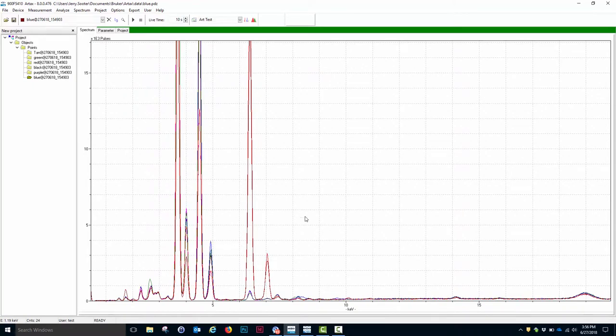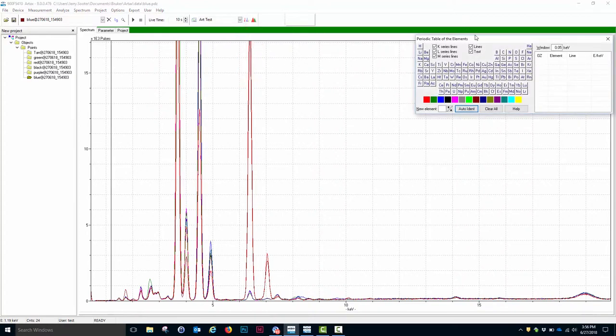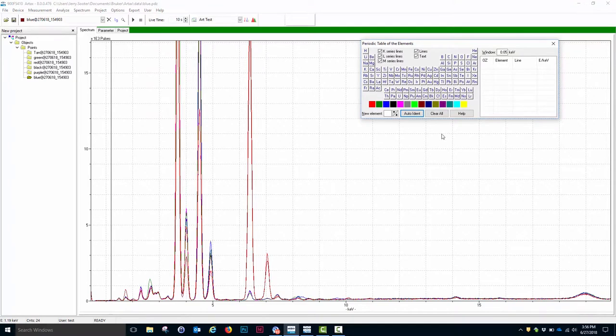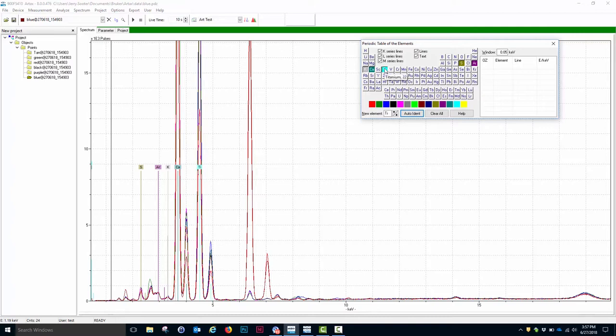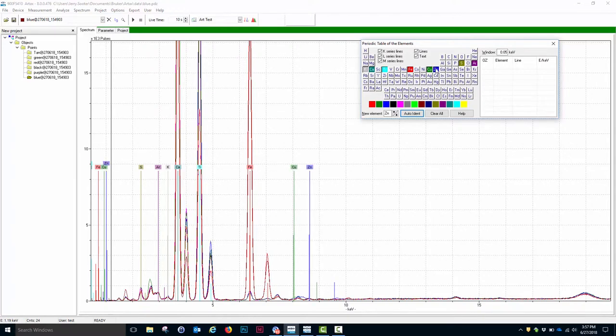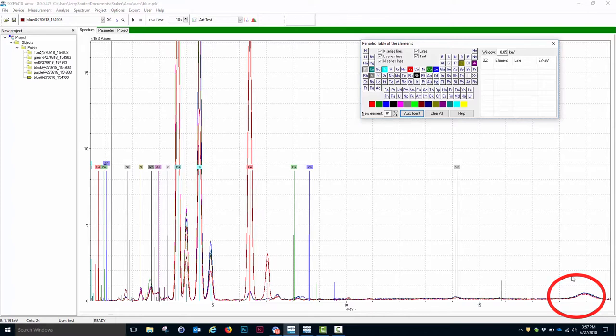Now what I need to do is identify the elements in these spectra, which I do by clicking on this icon, which brings up the periodic table. By clicking on the various elements, I can see whether they exist or not. For example, if I click on the sulfur icon, that line lines up very well with peaks in the spectrum. I've got argon from the air. I've got potassium, calcium, titanium, iron, copper, zinc, and strontium. In addition, in this spectrum, I have the rhodium tube lines. And what I see right here are the rhodium backscatter, the rhodium Compton lines.